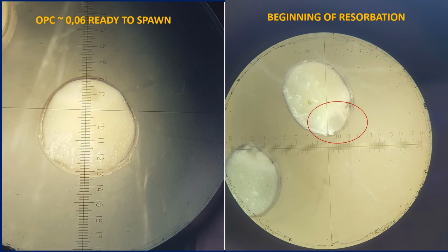And 2 more examples. On the left picture is an oocyte from a female ready for hormonal stimulation. Optimal values for hormonal stimulation and spawning are OPC from 0.07 to 0.04, on average about 0.05. In the right photo, we can see that the germinal vesicle has come close to the sheath.